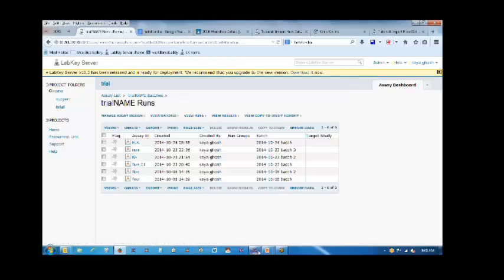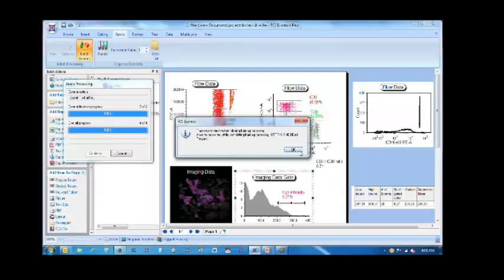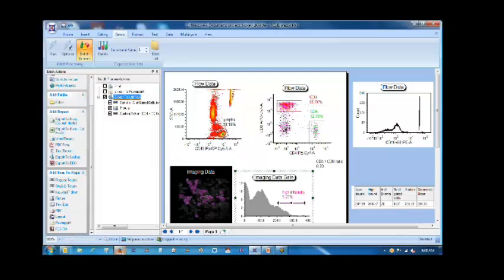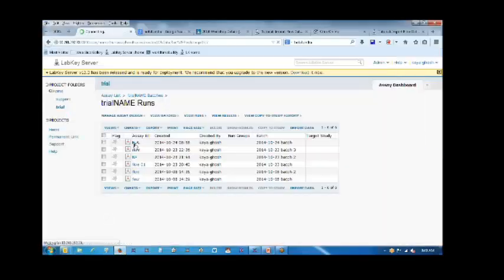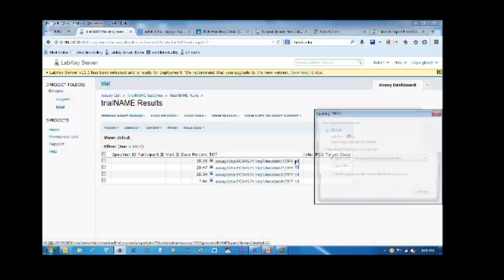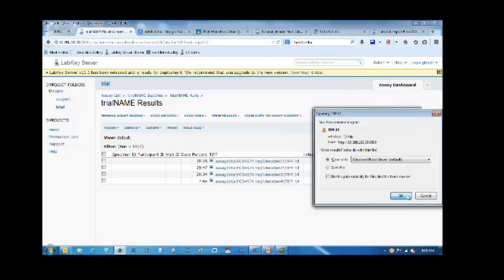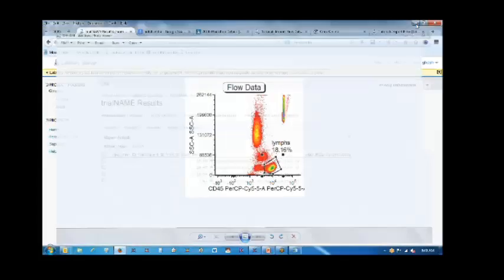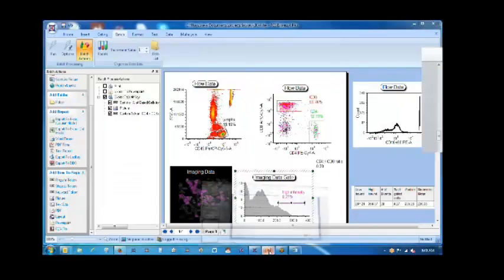Let's see, I'm not sure if it's... It's interesting. I just ran this, not sure why that didn't go. I do have a previous run that we exported earlier with all the similar results there. So anyway, here you can see that we exported some TIFFs, and then the percent is there. The ratio field from that past run isn't there, but we can just open that up and see that the TIFFs worked. Okay, so there's one of the TIFFs that we exported. So I'll just come back to the talk.